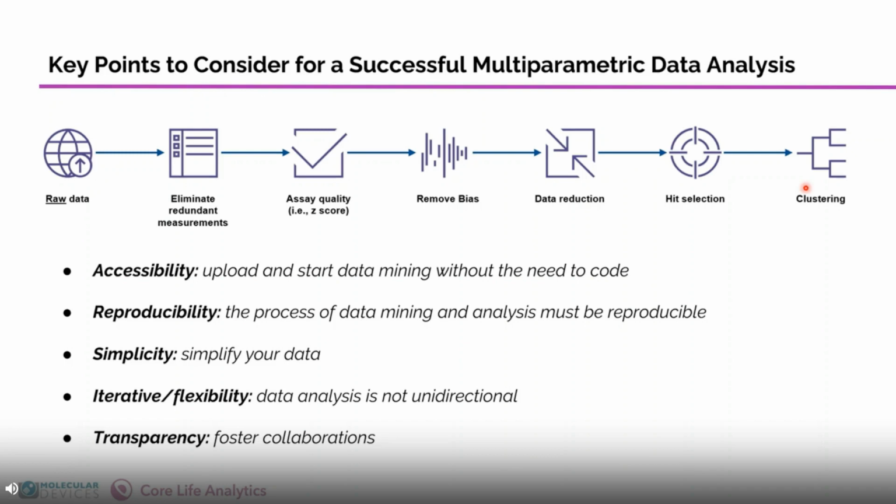And with this workflow, having a huge amount of data from high content screens is no longer something to be afraid of or intimidated by, because now you can make your data and your data analysis accessible, reproducible, simple yet versatile, and transparent. So this is how you can successfully get from A, with beautiful images coming out of a high-content imaging instrument, to B, where you can visualize the data and analyze them quickly and intuitively to discover new knowledge from your data.